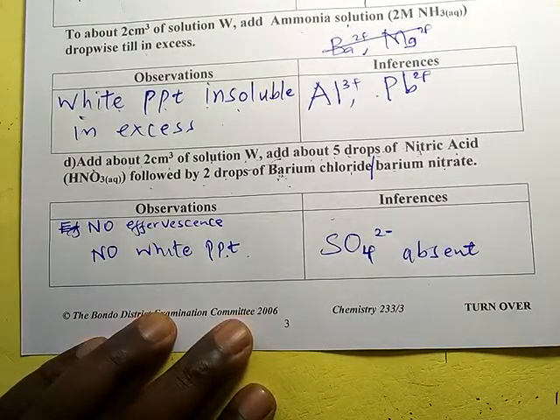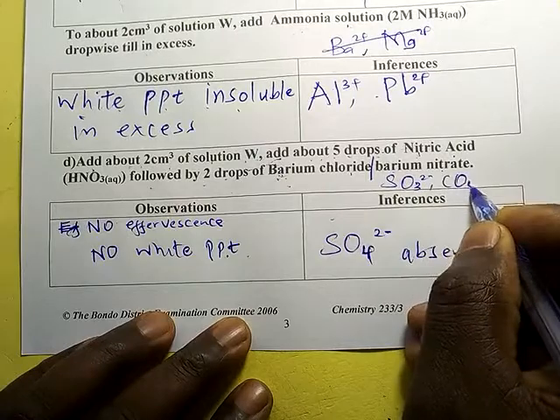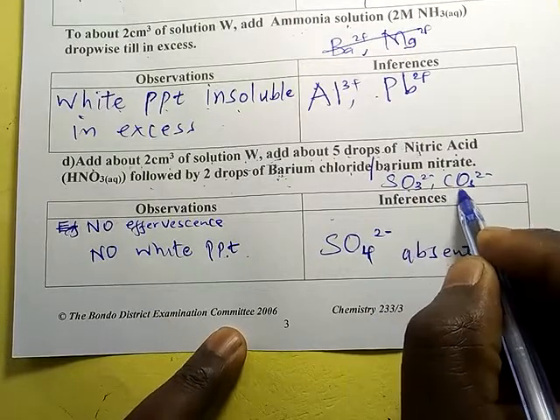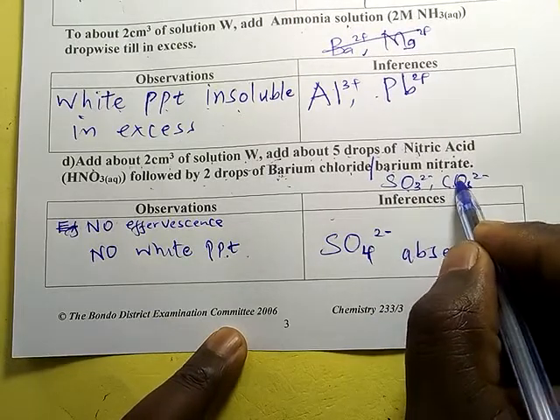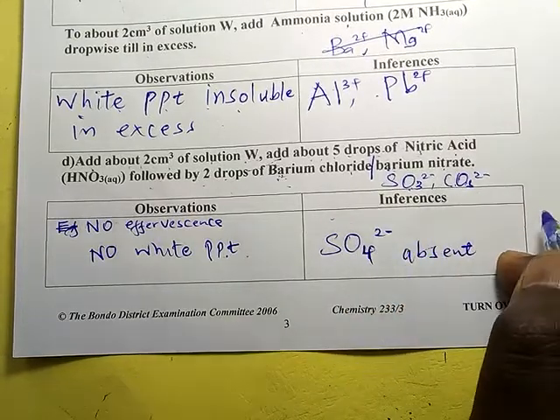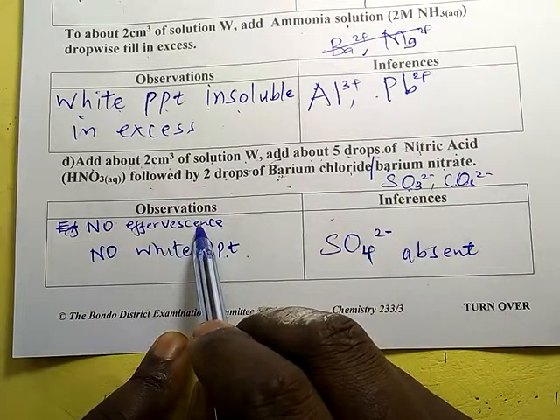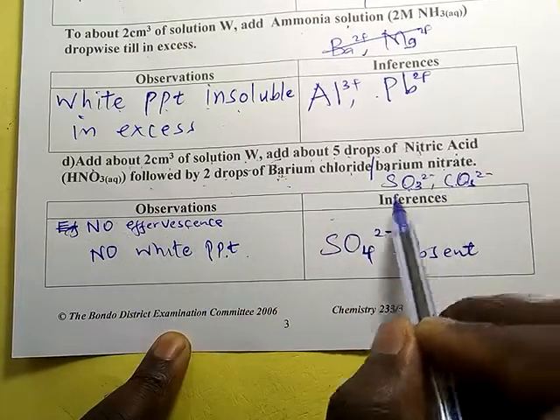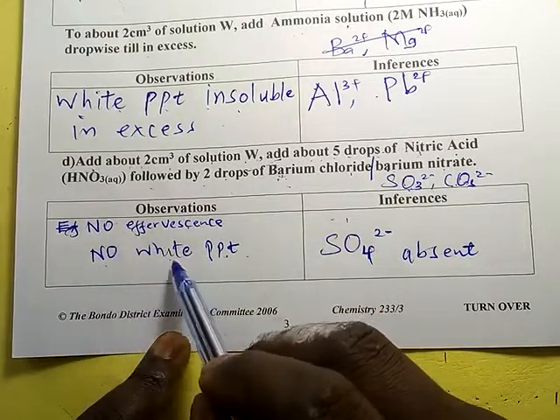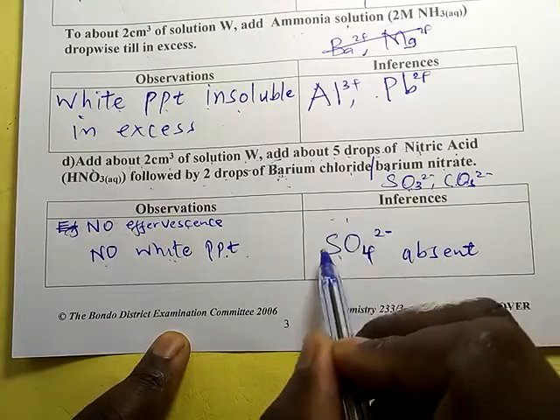Now the question most people ask is that the sulfite and the carbonate form a white precipitate with barium. Barium sulfite is a white precipitate. Barium carbonate is a white precipitate. Why didn't we include them here and say these three are absent? If they were present, we would see effervescence, right? So if there is no effervescence, it means they are absent. And then there is no white PPT. If there was a white PPT, then sulfate ions are present. So I hope you have understood that.